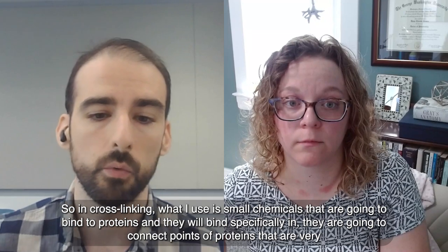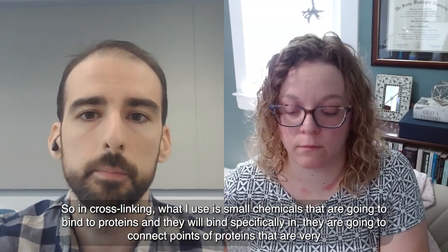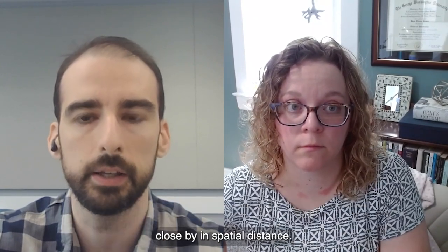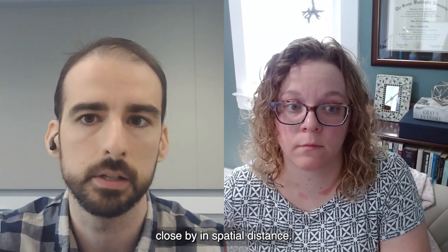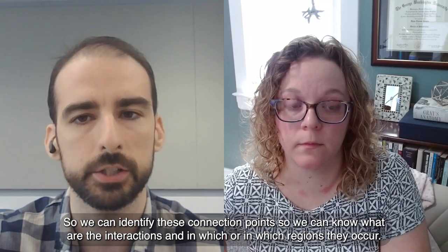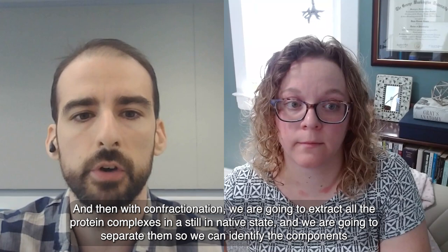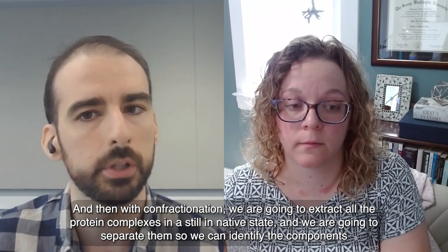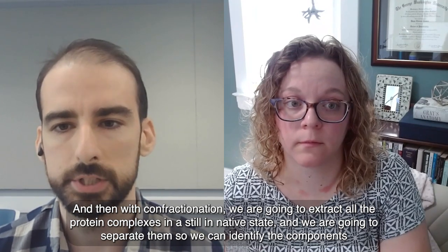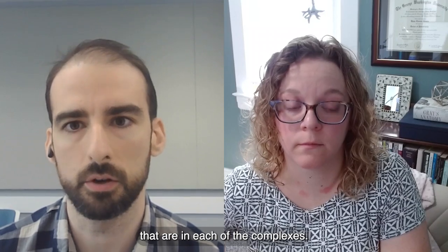In cross-linking, what I use is small chemicals that are going to bind to proteins, and specifically they are going to connect points of proteins that are very close by in spatial distance. So we can identify these connection points, so we can know what the interactions are and in which regions they occur. And then with cofractionation, we are going to extract all the protein complexes still in native state, and we are going to separate them so we can identify the components that are in each of the complexes.